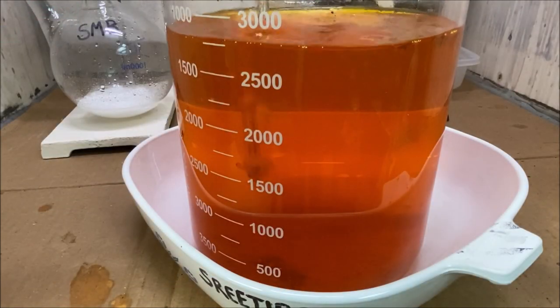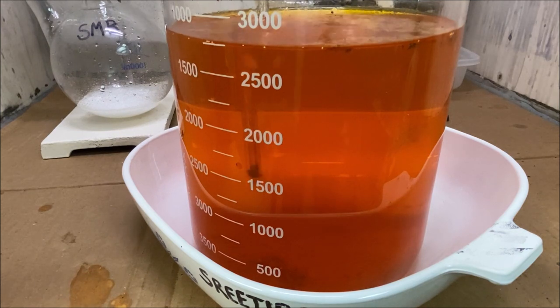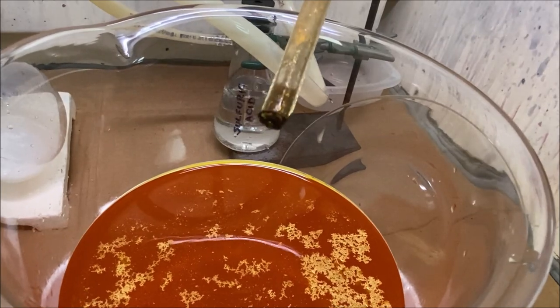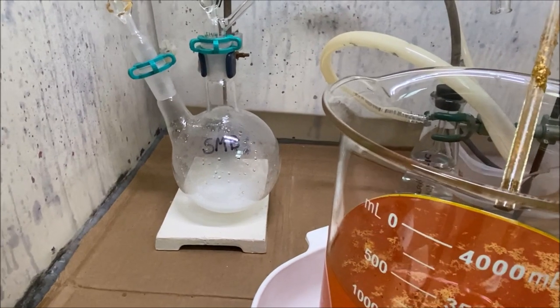All right, I turned up the acid flow and finally got a decent flow of gas going into our solution. But I don't think I added enough SMB to the gas generator. I think I'm going to have to take it apart and add some more SMB. Here you can see the delivery tube is coated with gold. The end is plugged up, so I'm going to have to increase the flow out of the gas generator by adding some more SMB.